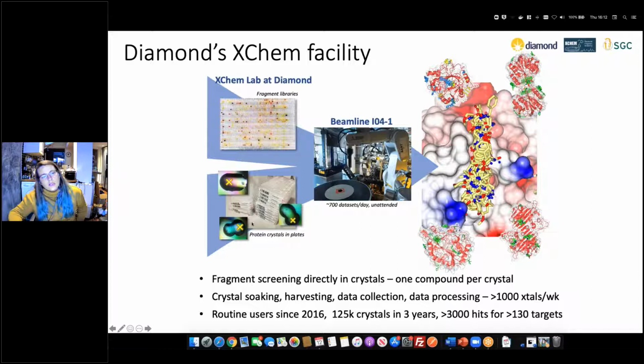We also crystallize our proteins into plates as well. Essentially, we decide what compounds we want to put in our crystals once we've identified the crystals and where they are. We use acoustic droplet ejection in a special machine to shoot the compounds at specified points into the protein drop to hit the crystals.